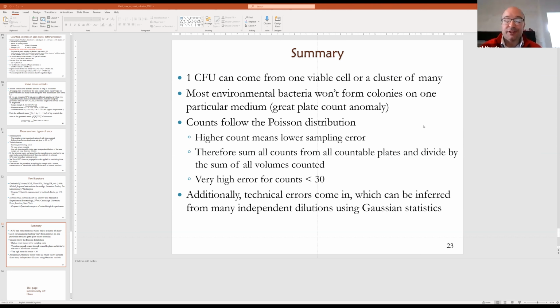You don't get the number of colonies that came from reported. So you're not sure, I suppose, how reliable the data are. But I guess if most people would follow this sort of rule of thumb between sort of 30 and 200, then I guess many people do that. But you never know. If they don't report the details, then probably they follow the normal procedure. That is what would be my suspicion.